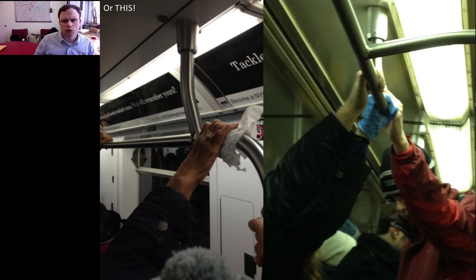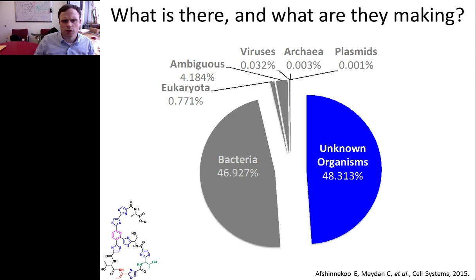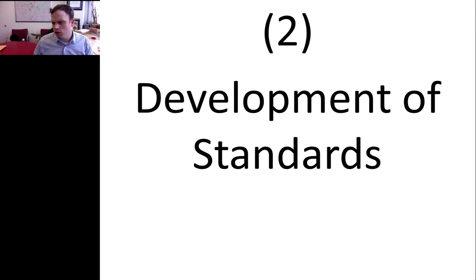But we really have a question of who's there and what are they making. And to do this, like any good experiment, you do need some control. So to that end, I want to describe some of the work that we've done, and a lot of this is in very close concert with Zymo. When I met some of the people from Zymo saying they wanted to develop a titrated standard of bacteria and yeast, I thought, well, that's fantastic, because it really either didn't exist, or what was out in the field, you could only order a very limited amount of it.